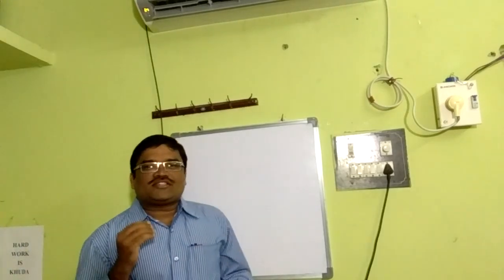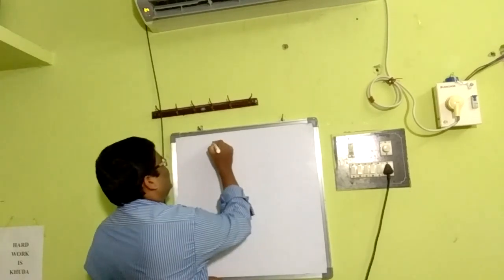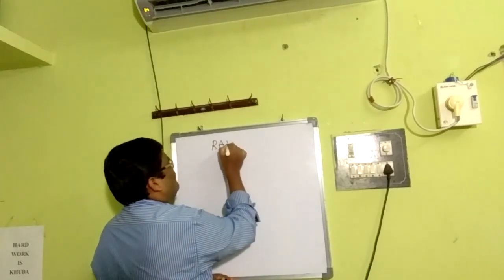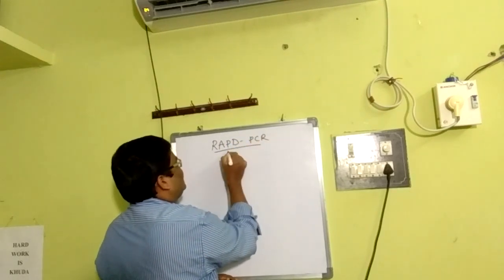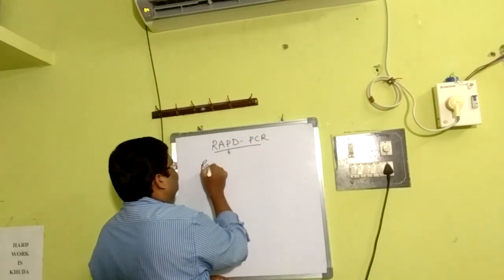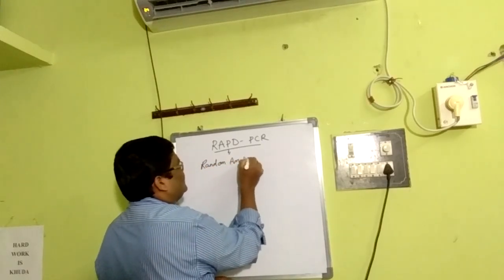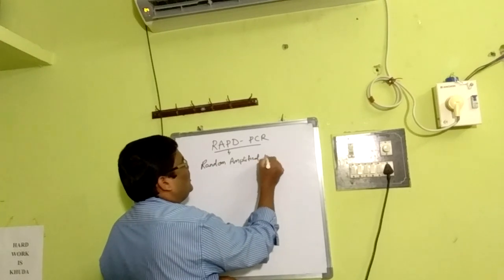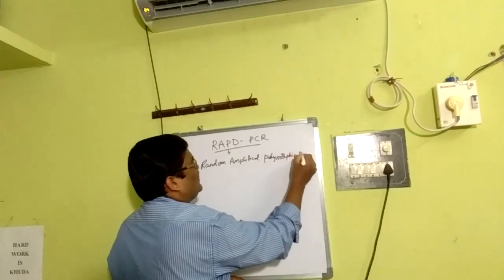Hello friends, today we are going to discuss one of the important topics, RAPD PCR. You know, rapid PCR. That stands for random amplified polymorphic DNA.